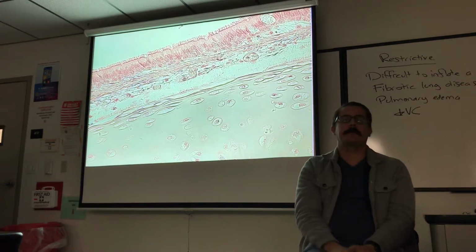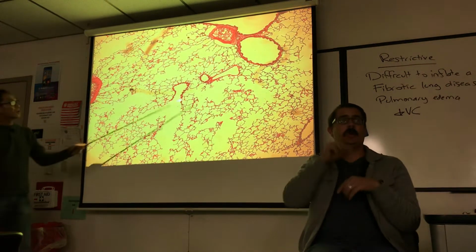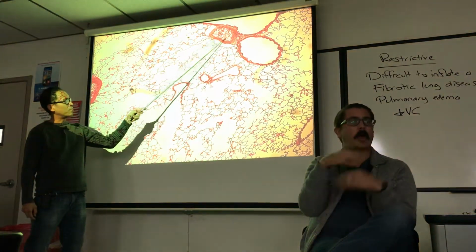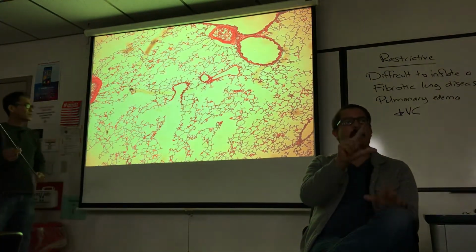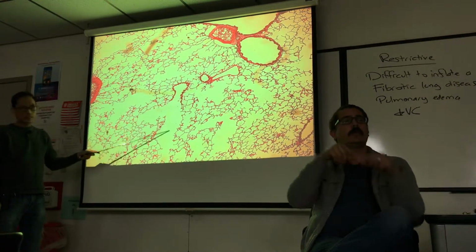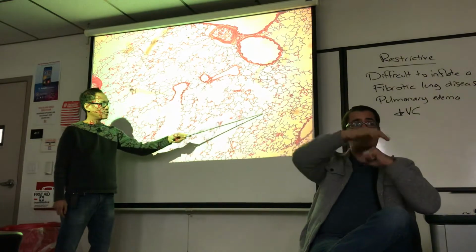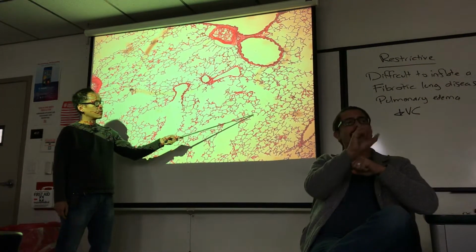So moving from trachea to deep inside the lung tissue, I see some structures up here. These are bronchioles. There's nothing in them. They're supposed to be air. That's a blood vessel. I see red blood cells in there. I can recognize the vessel wall there. This is a really good example of a bronchiole dividing into alveolar ducts. Okay, right here, right here. If I point to this structure, it's a structure surrounded by individual alveoli. That's an alveolar sac. So an individual dead end is an alveolus.